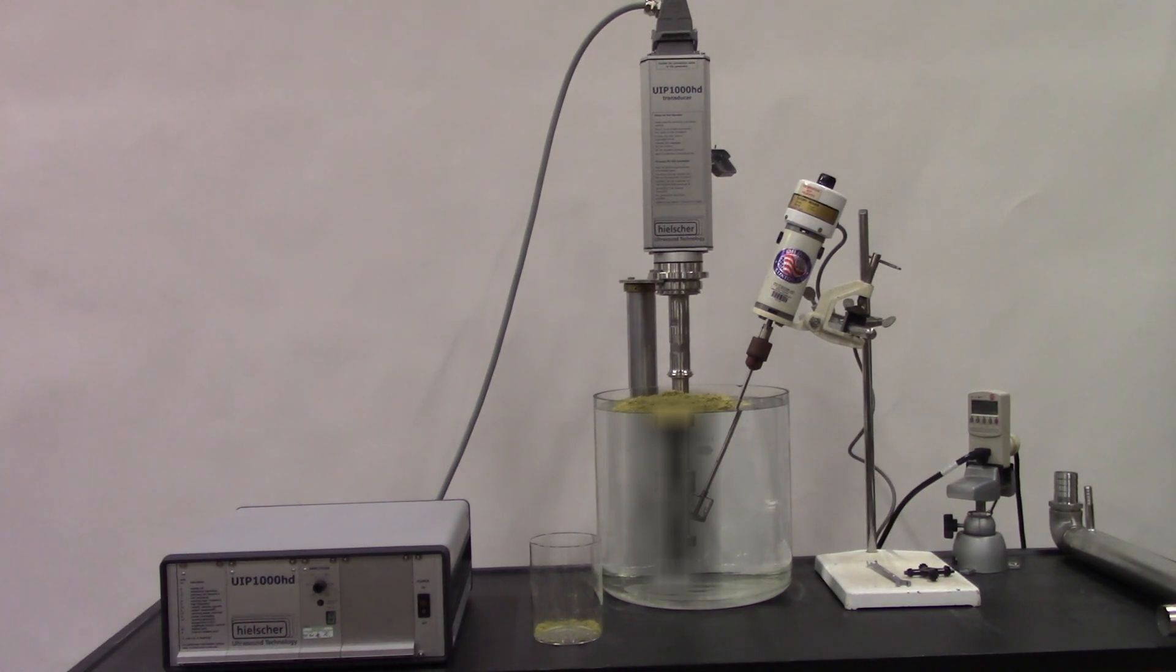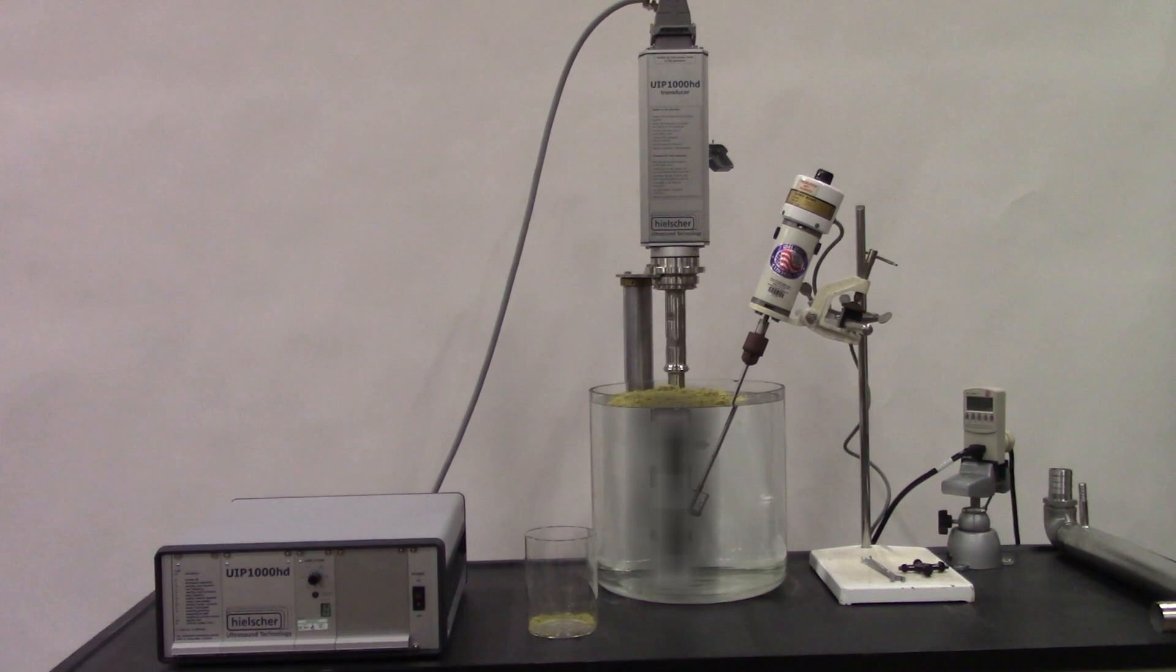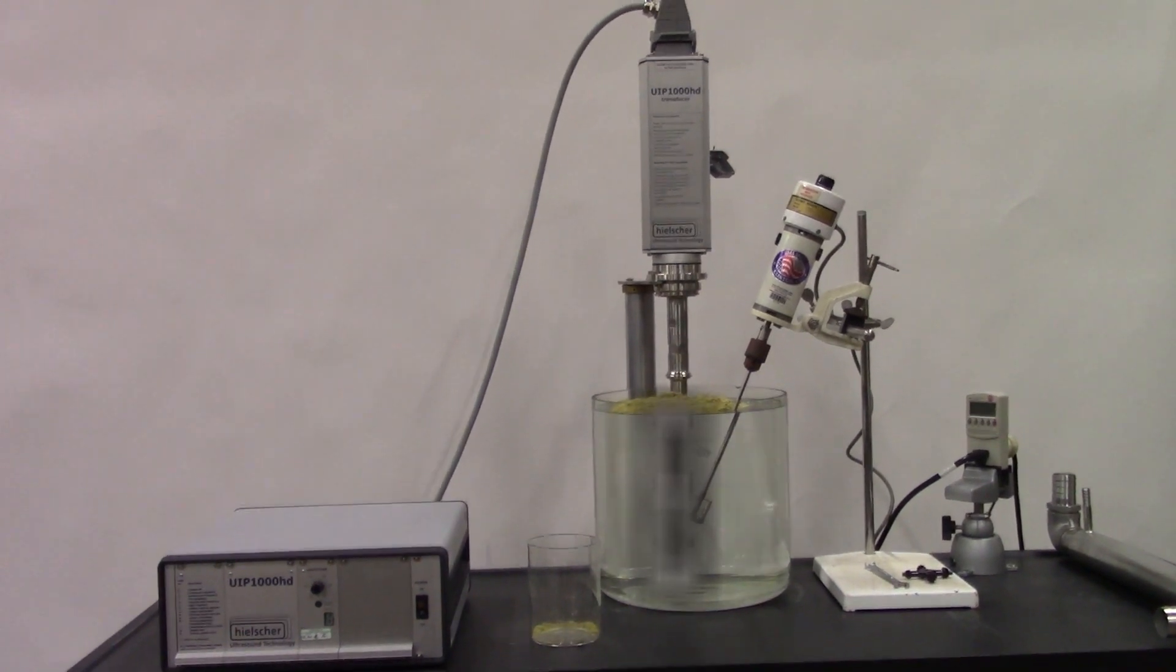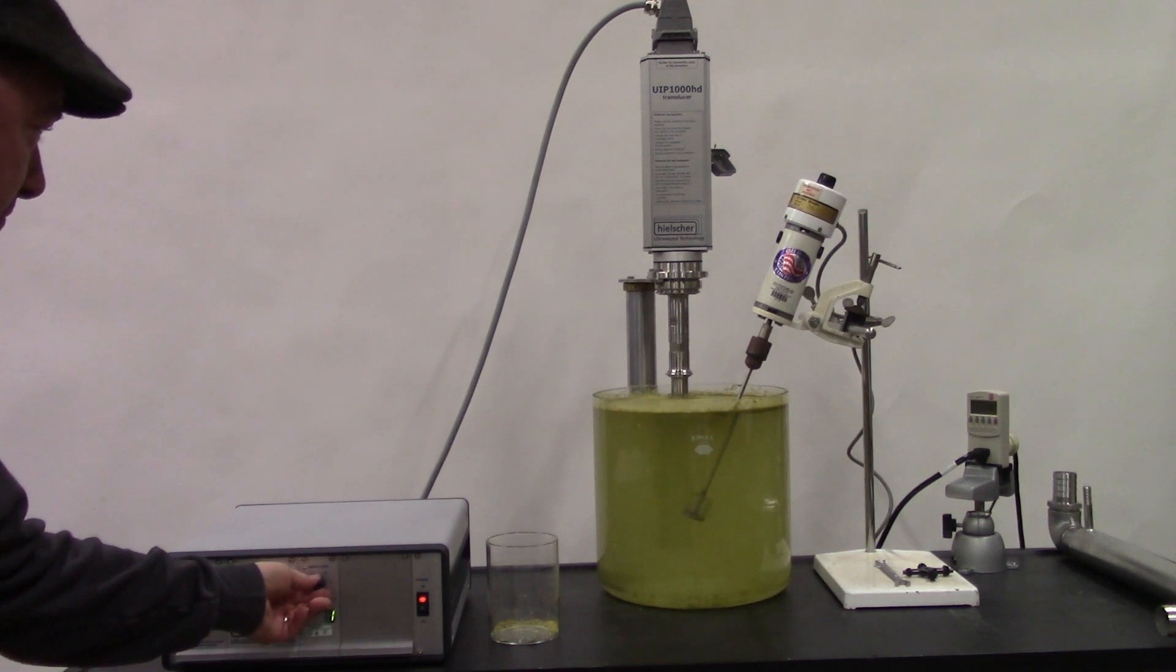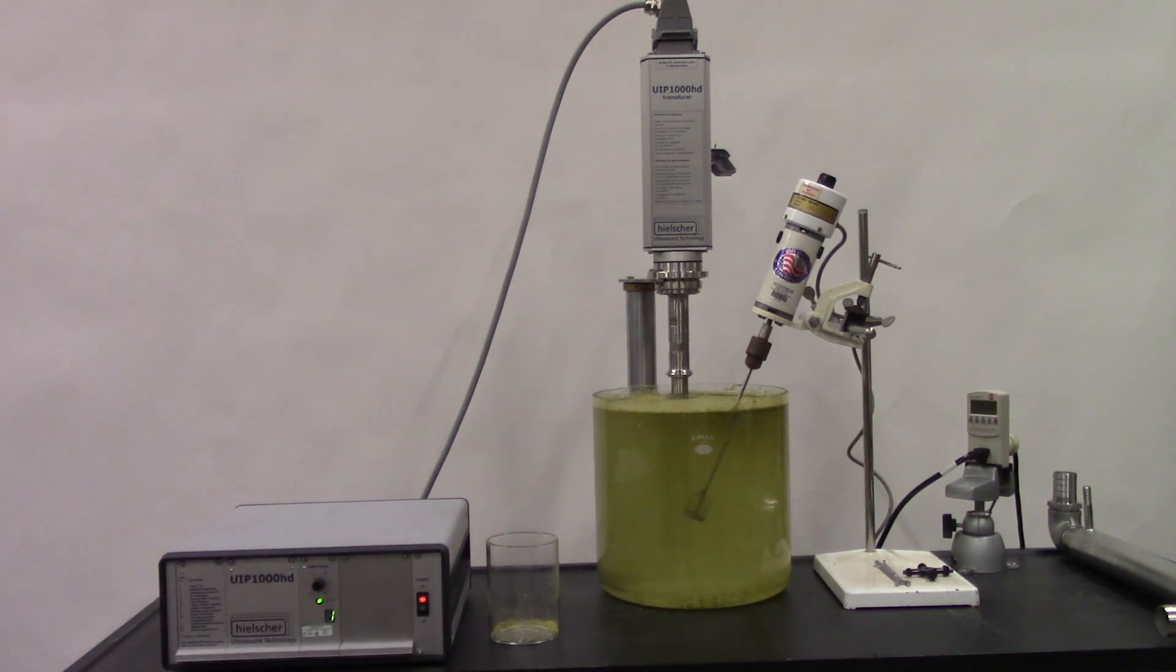We'll also have an overhead mixer to help disperse the hops particles within our reservoir. Next, we'll be turning on the UIP-1000 HD. This is a 1,000-watt unit, and it is excellent for ultrasonic extraction.